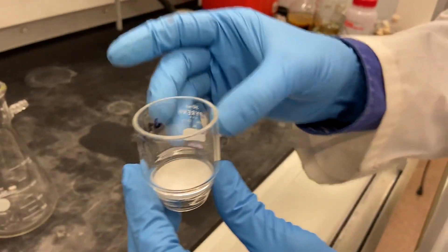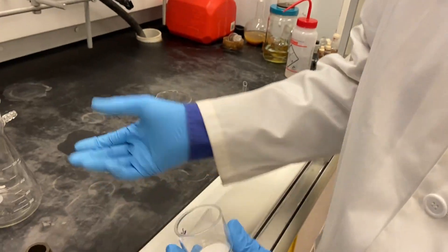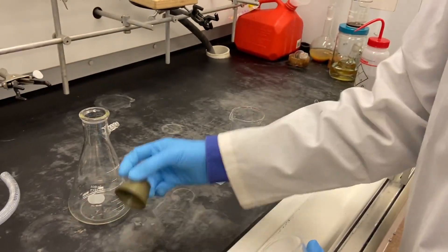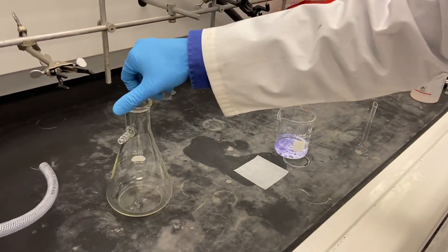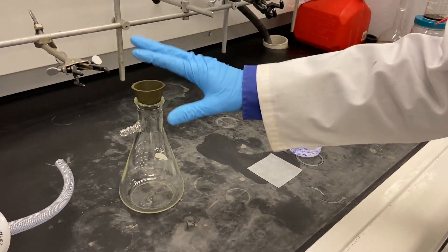The solvent will not stick to it, you can wash it down. It's really nice to use. There are many ways how you can employ it. Usually you have a suction flask and you put a rubber cone in there.